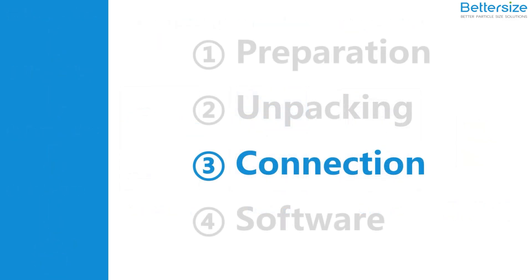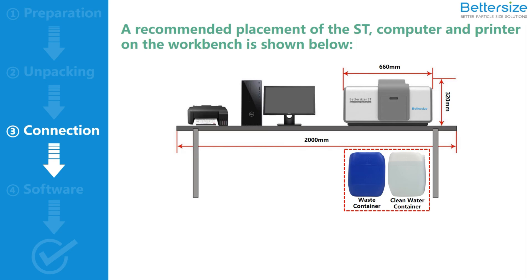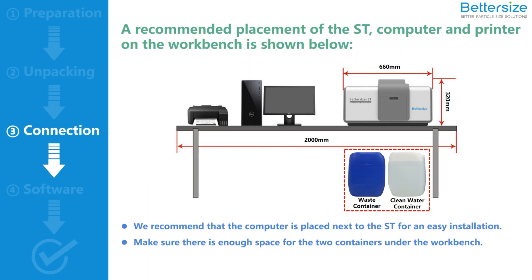Now you are ready to install the Bettersizer ST. We recommend placing the ST, computer, and printer in the order shown in the video. Please place your computer next to the Bettersizer ST for an easy installation, and make sure there is enough space for the two liquid containers under the workbench. Once the placement is complete, you will start the connection from the backside of the Bettersizer ST.